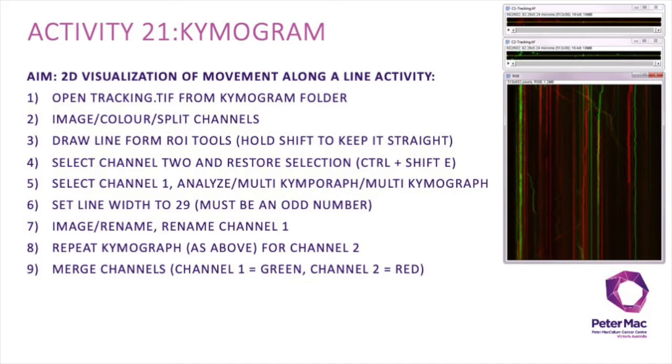Okay, we've reached the end. This is the last activity, and this is showing time-lapse data in a 2D visualization using something called a Kymogram. So activity 21 is using a Kymogram.